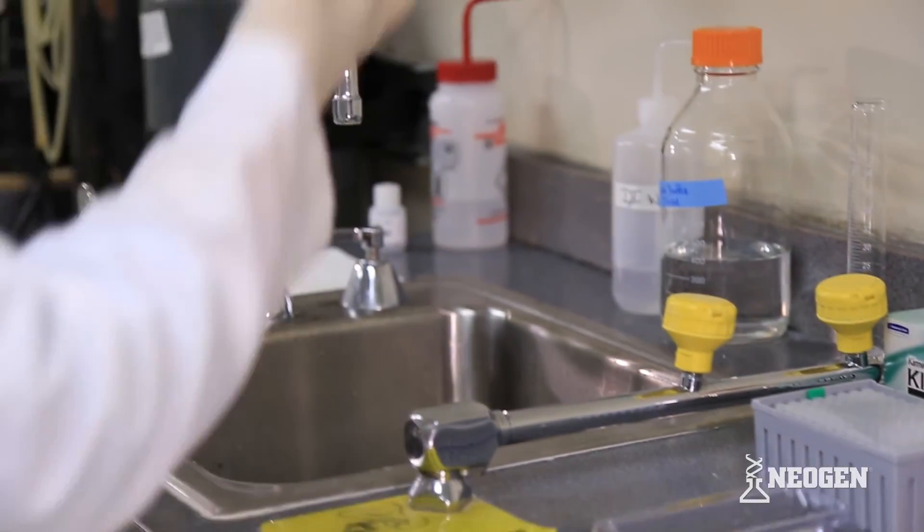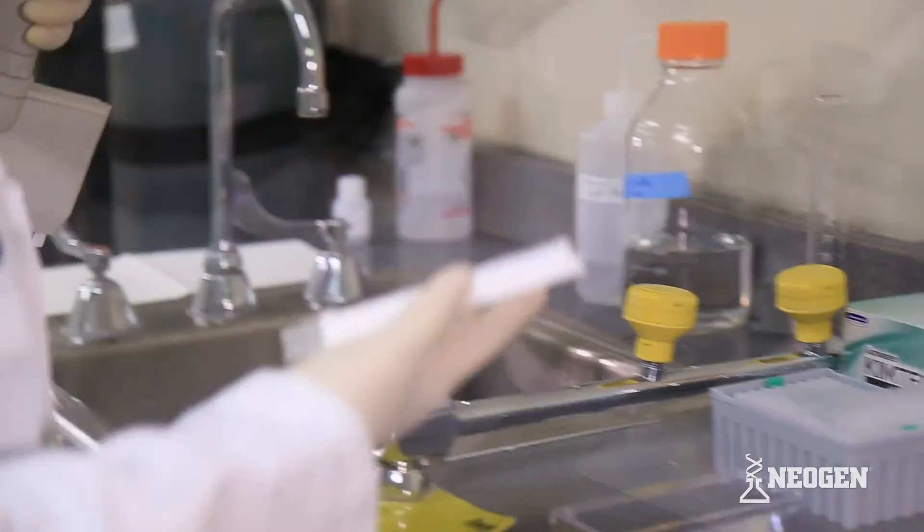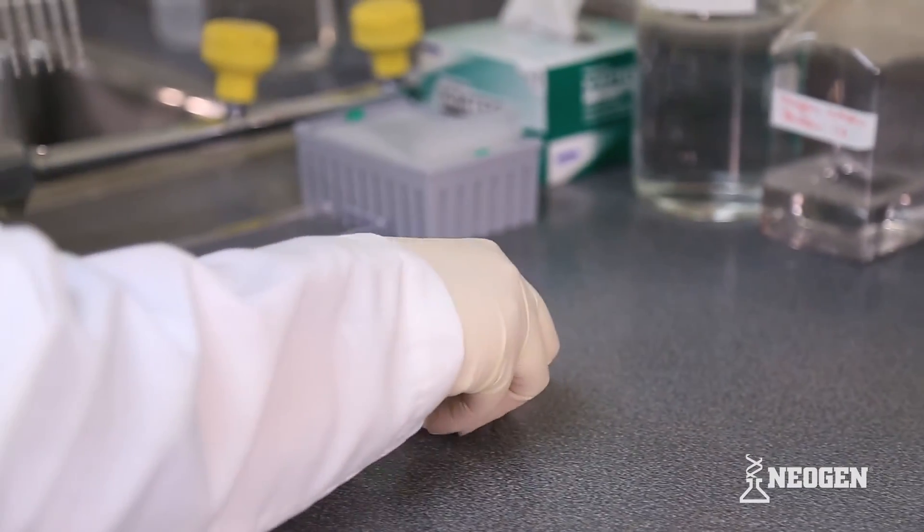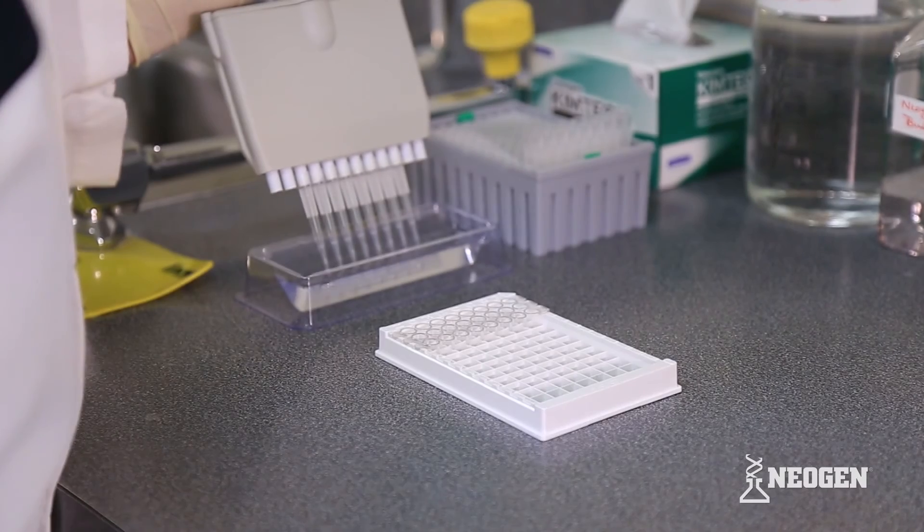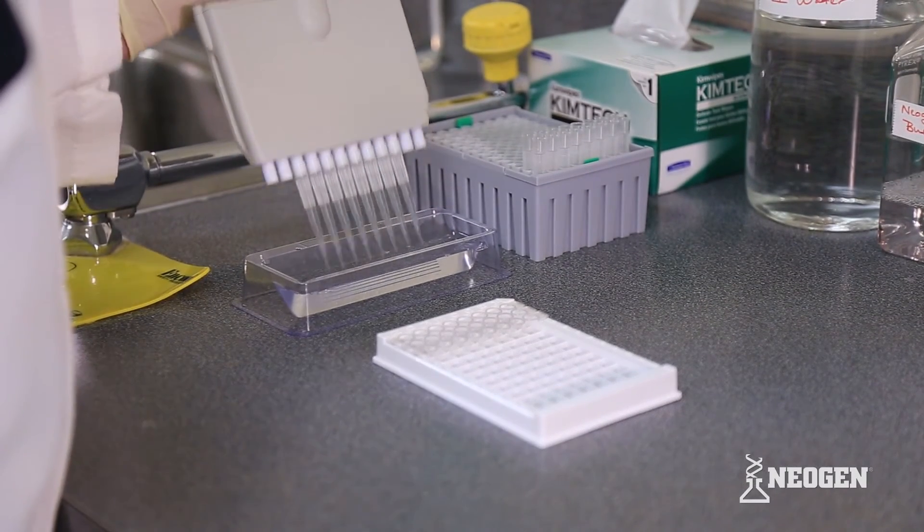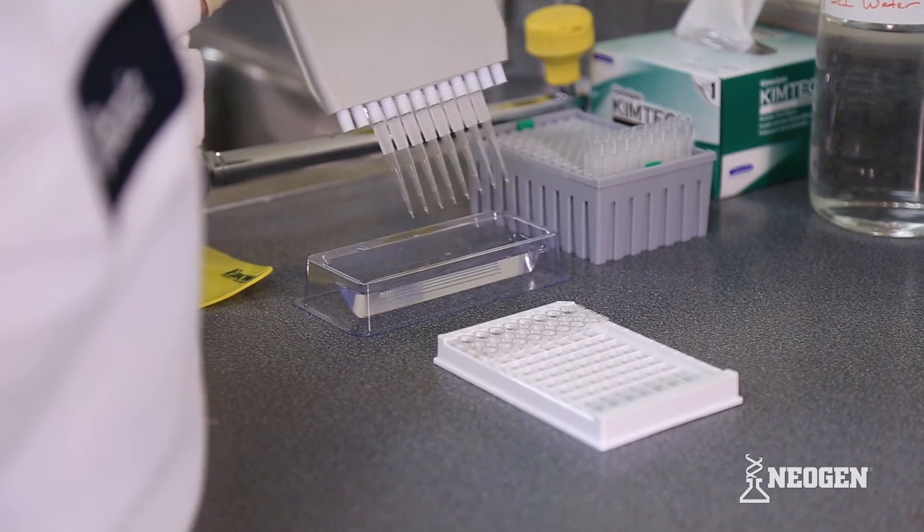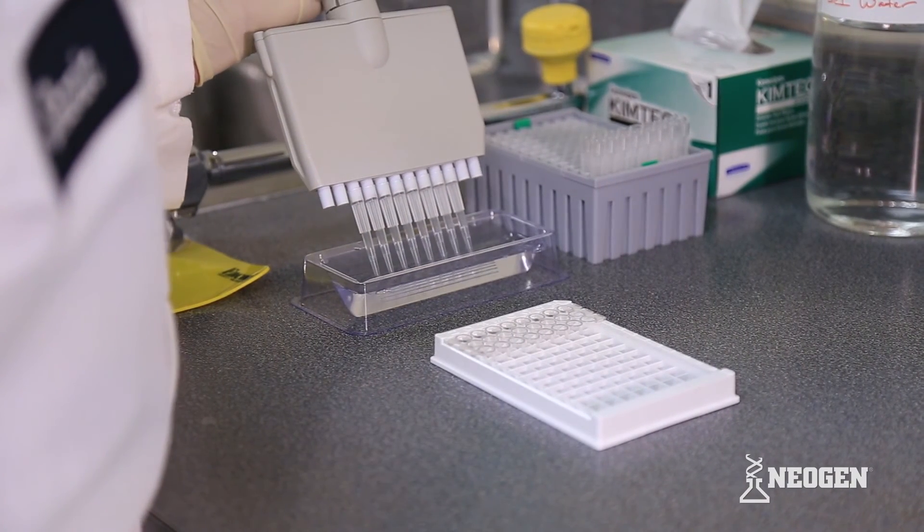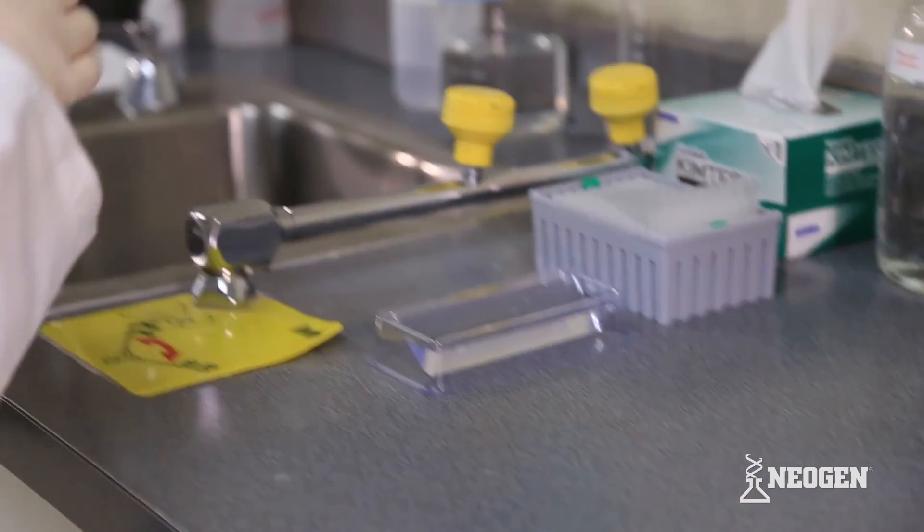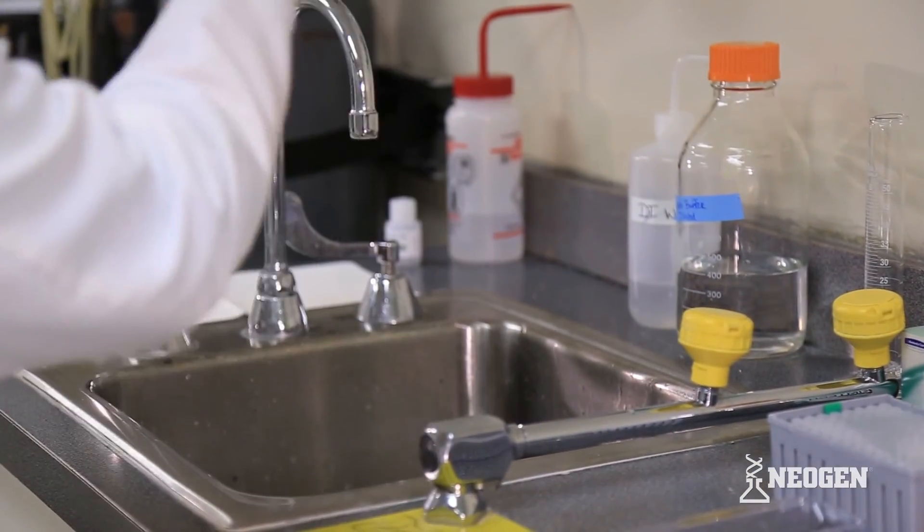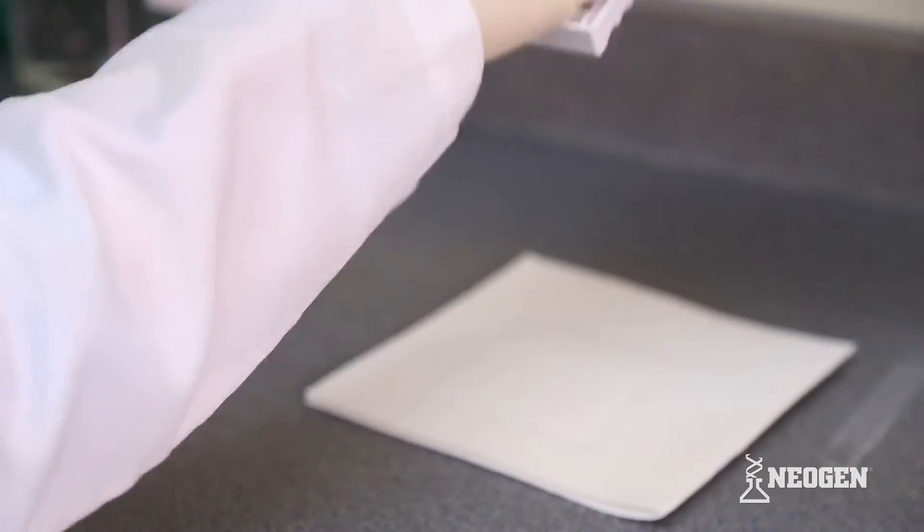Once 45 minutes has elapsed, dump the liquids from the wells. Tap the plate clean on a lint-free towel to remove any remaining liquid in the wells. Wash the plate by adding 300 microliters of the prepared wash buffer to each strip using an 8 or 12 multi-channel pipette. Once the wash buffer has been added to all of the strips, dump the liquid and tap the plate clean on a clean, lint-free towel. Repeat this step for a total of 3 washings.